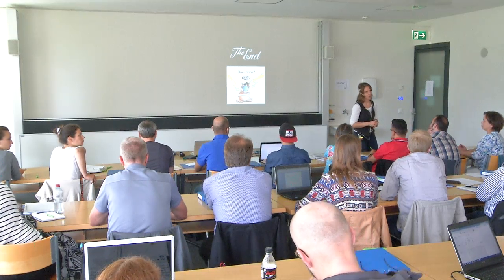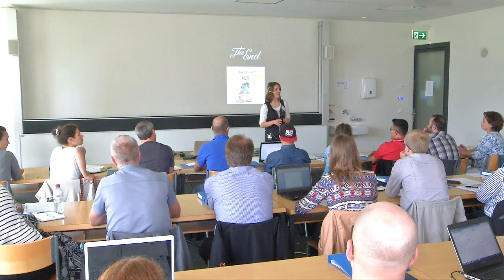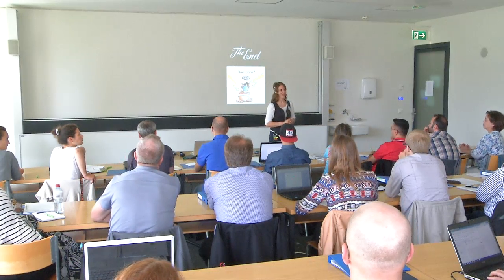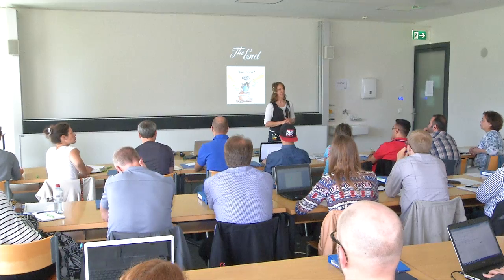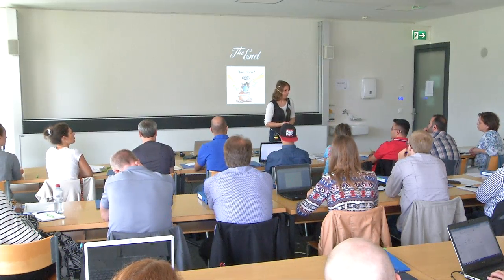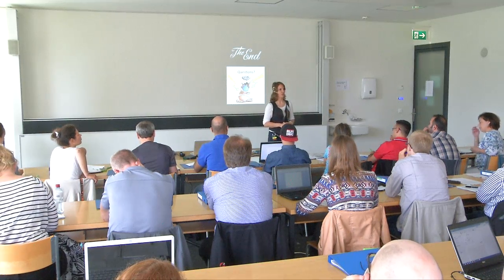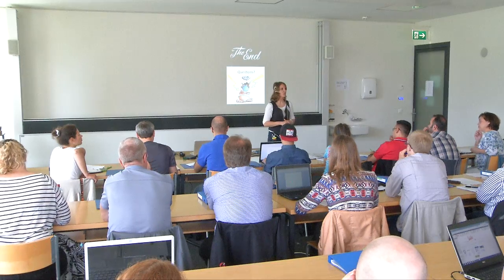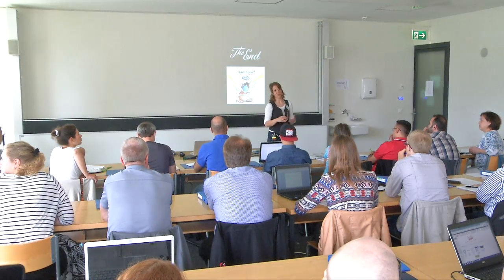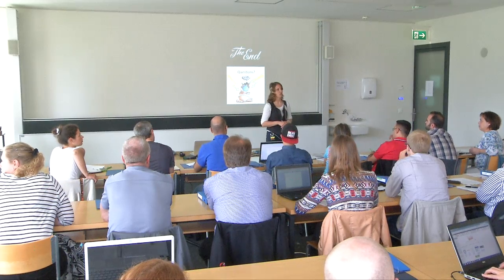No, not at all. There's almost no reason. We will come to this a lot tomorrow in the quantification lecture. But there is no reason not to use a heavy label. It's always beneficial to have a heavy reference peptide, but it's of course expensive, right, to do this. And it is possible to do also label-free quantification with targeted proteomics. You will have certain disadvantages, and we will talk about them tomorrow.